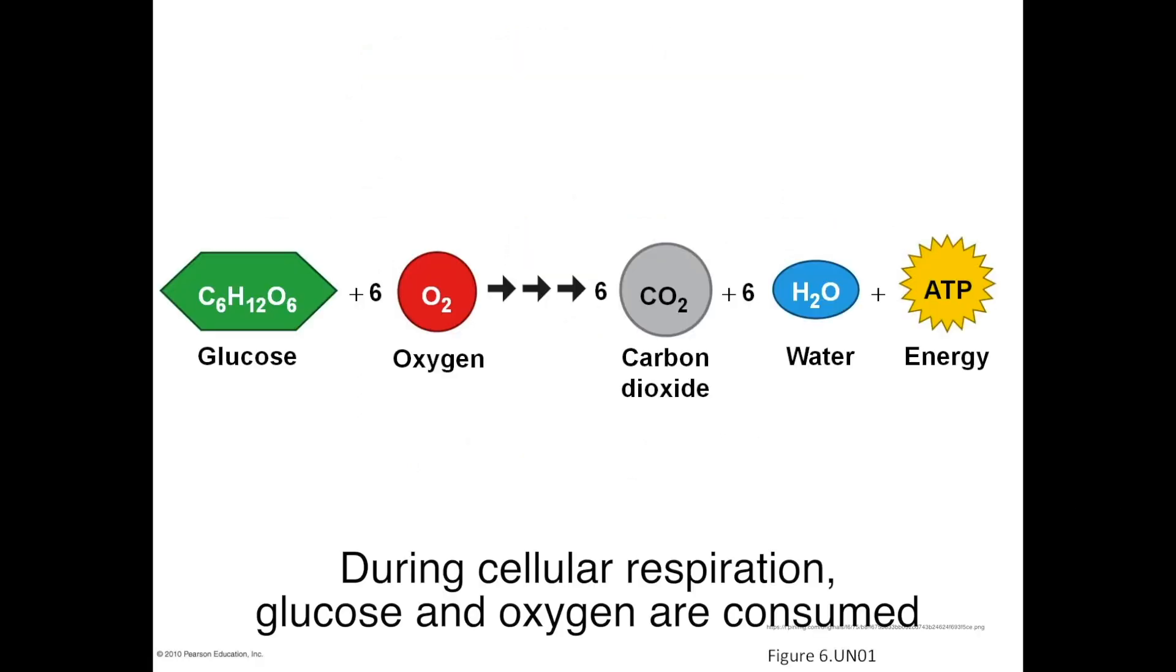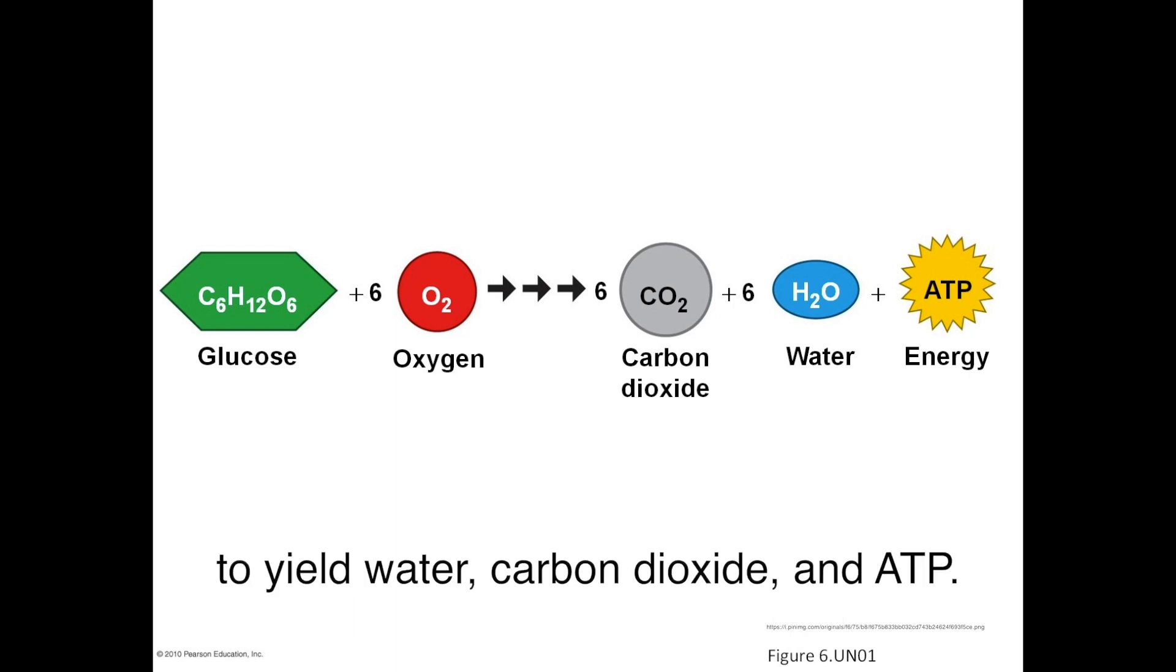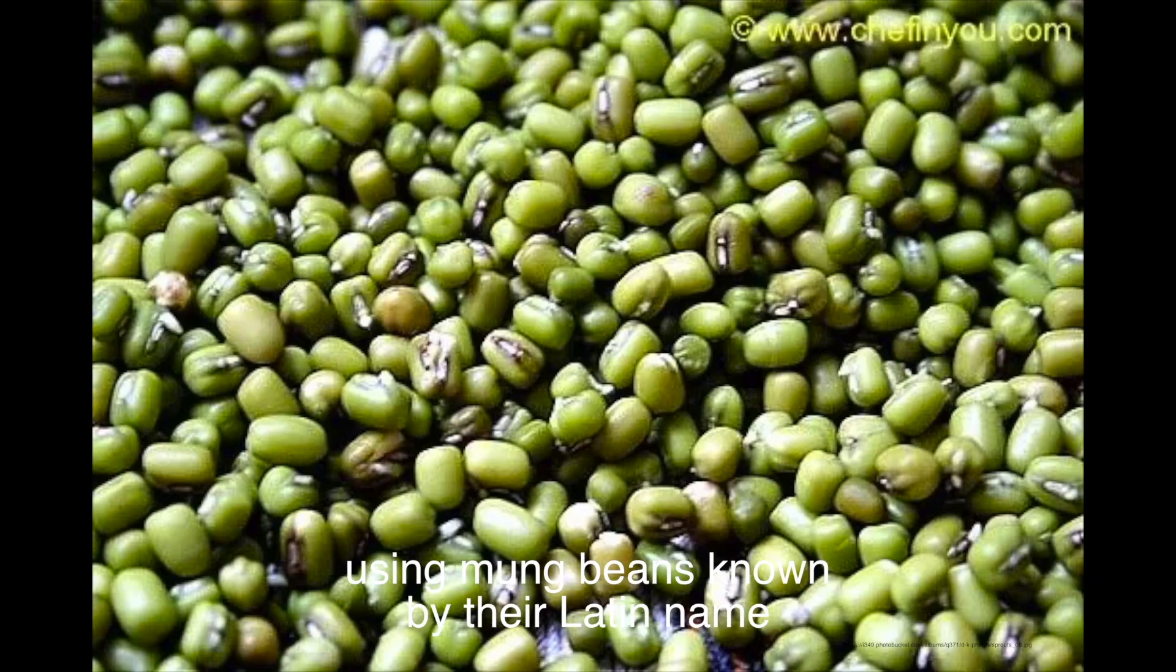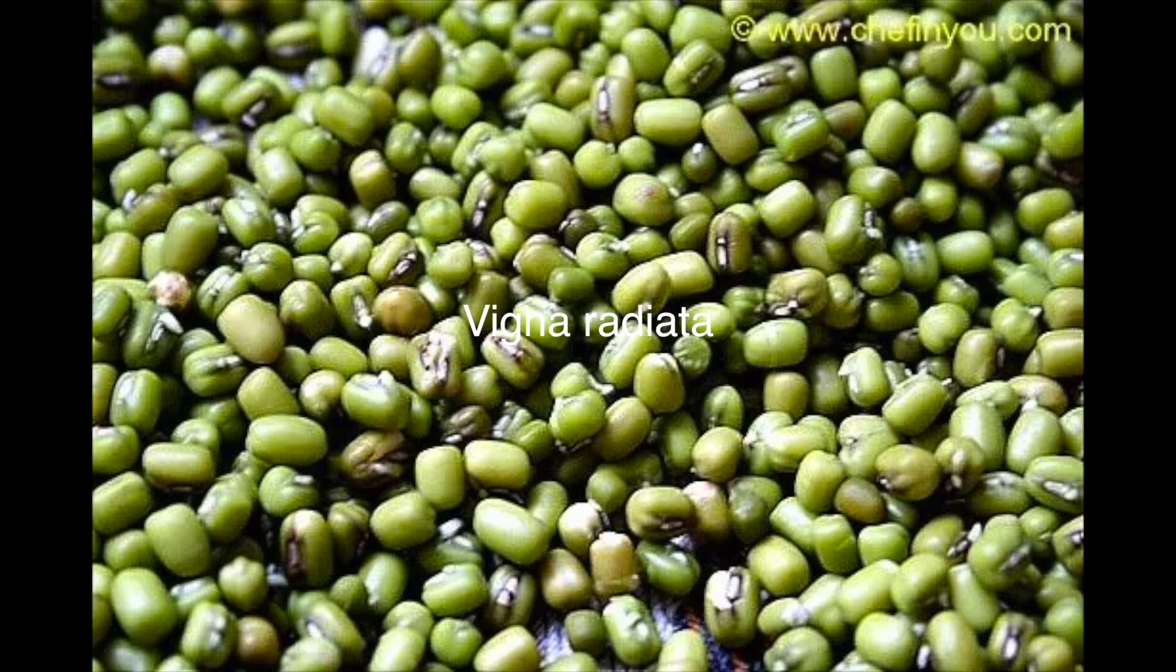During cellular respiration, glucose and oxygen are consumed to yield water, carbon dioxide, and ATP, the energy that fuels cell metabolism. Through this video you will be able to visualize this process using mung beans, known by their Latin name of Vigna radiata.